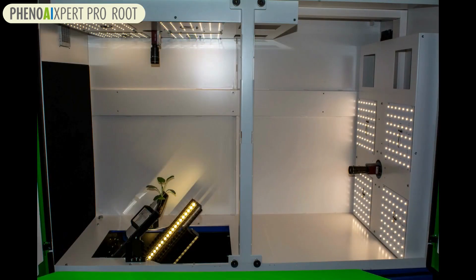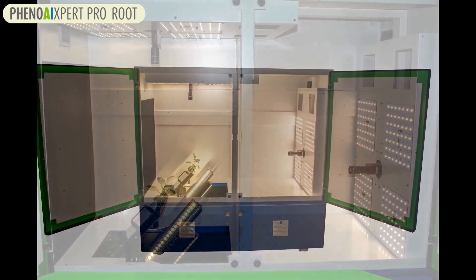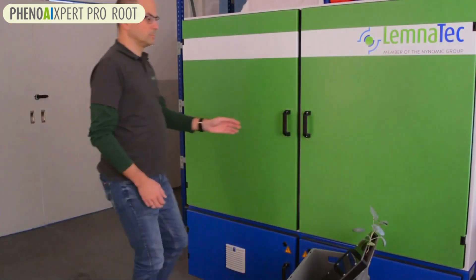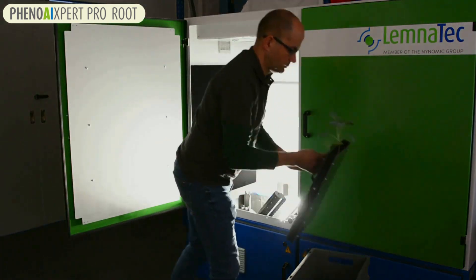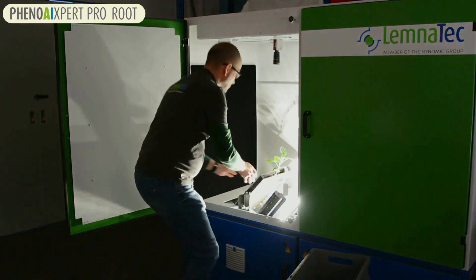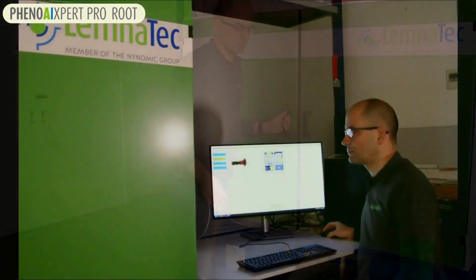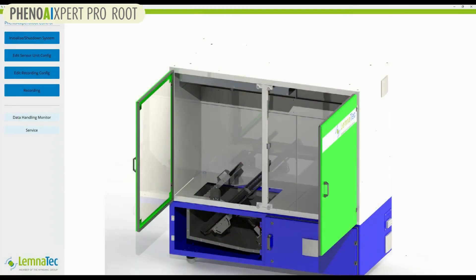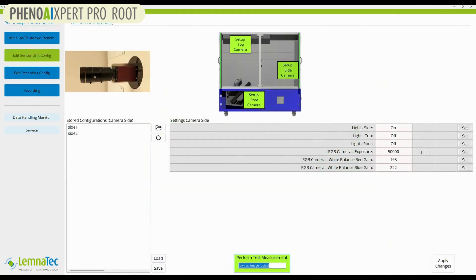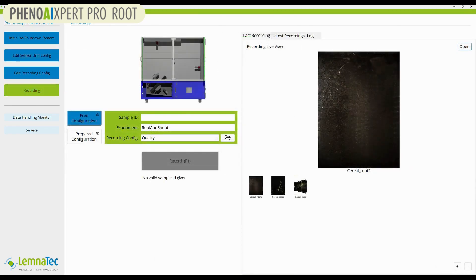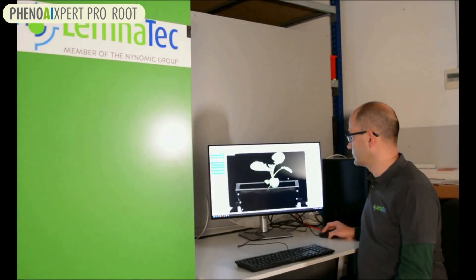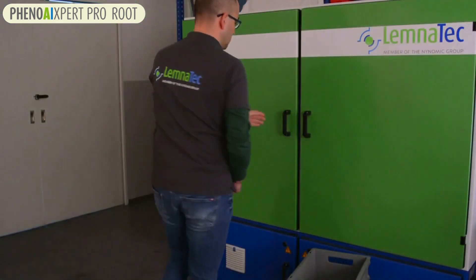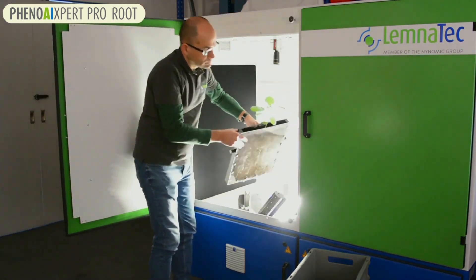It has a cabinet with cameras directed to shoot the root of the plant in the rhizotron. Operation is easy — just place the rhizotron inside the cabinet, then go to the computer and operate the LemnaTec control software. Here you can do all necessary camera settings and trigger the image acquisition. Recorded images are stored and are ready for processing, then you can exchange the rhizotron.